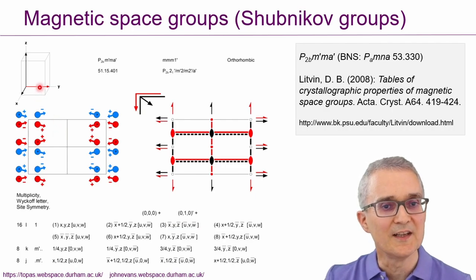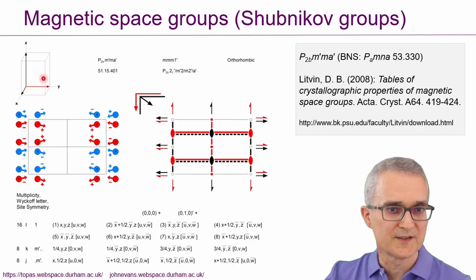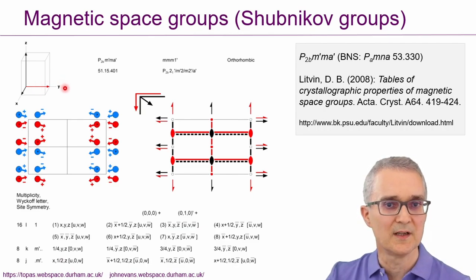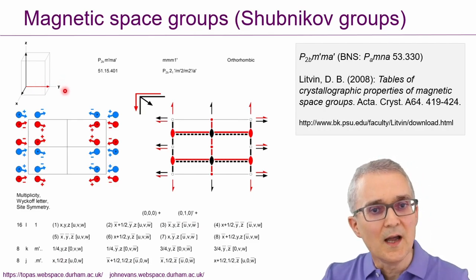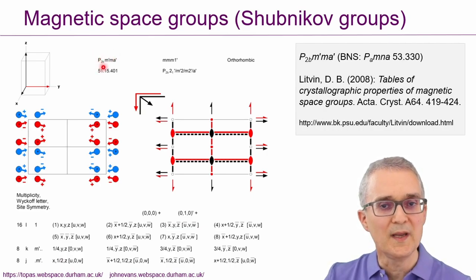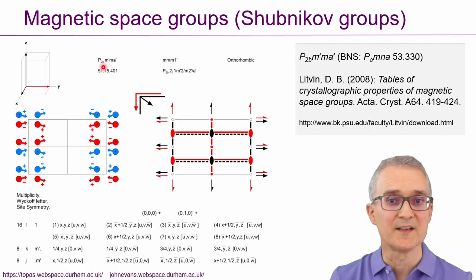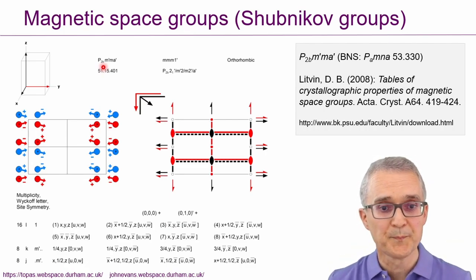That's telling us that you would have antiferromagnetic arrangements between one part of the unit cell and the next part of the unit cell over. You can see some hints that that's happening in this space group name. Where it says P sub 2b, that's telling you that the b-axis is doubled relative to the paramagnetic space group that this is derived from.